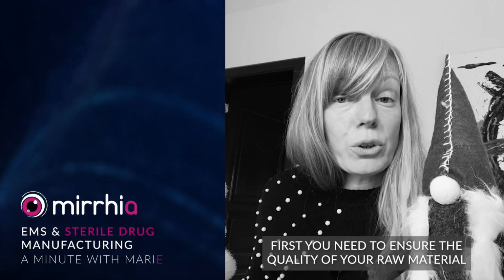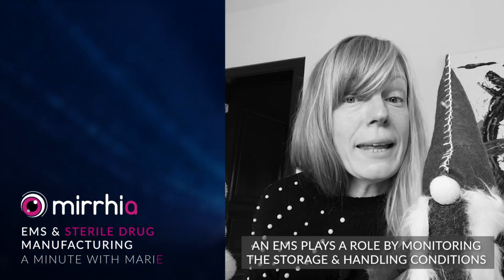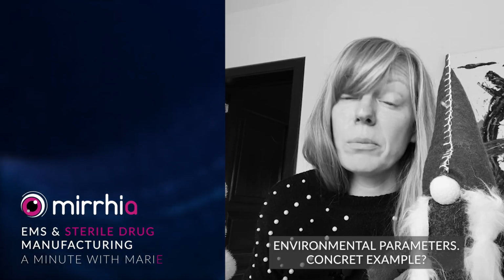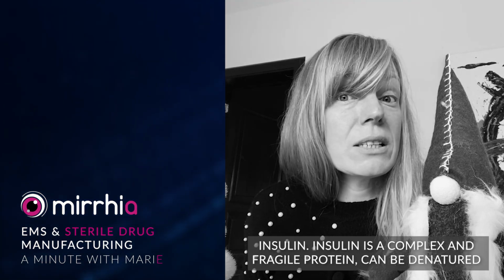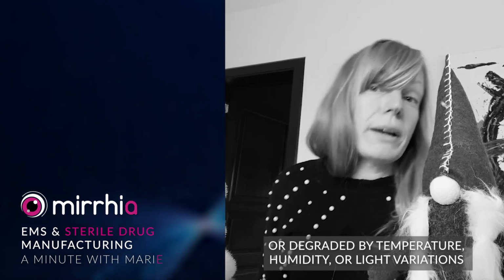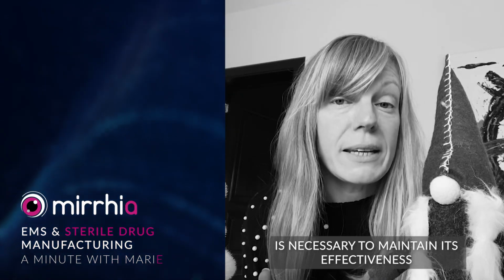First, you need to ensure the quality of raw material. An EMS plays a role by monitoring the storage and handling conditions of raw material, controlling temperature, humidity, and other environmental parameters. Concrete example, insulin. Insulin is a complex and fragile protein that can be denatured or degraded by temperature, humidity, or light variations. Therefore, careful control of storage and transport is necessary to maintain its effectiveness.